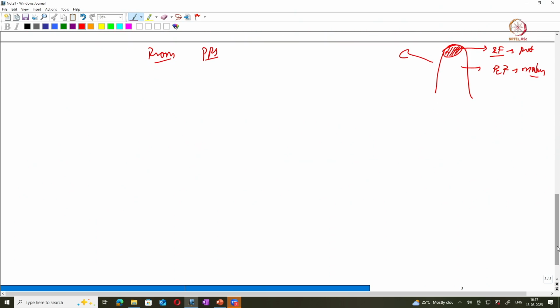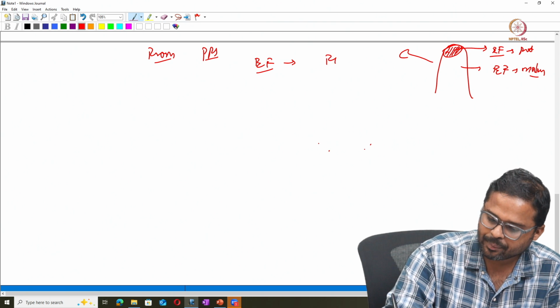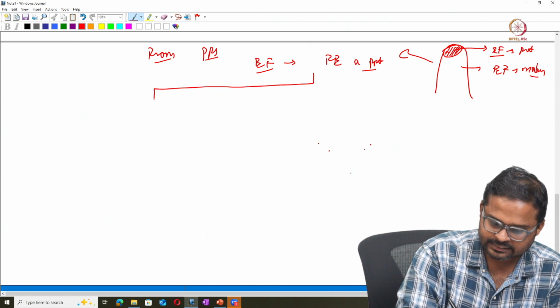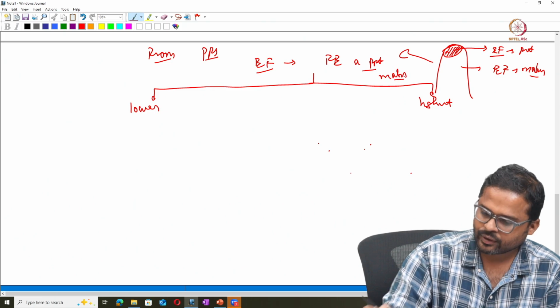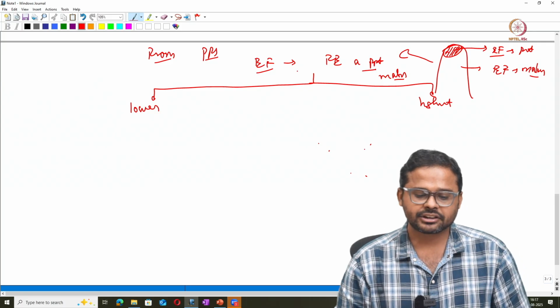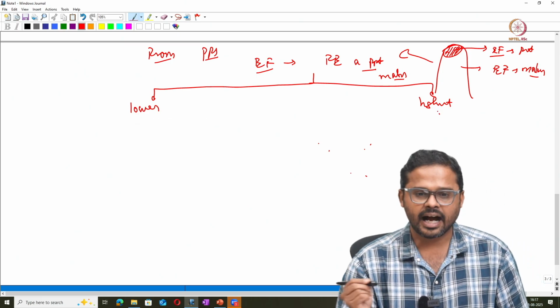The electric field required to field evaporate a precipitate is either lower or higher than the matrix.